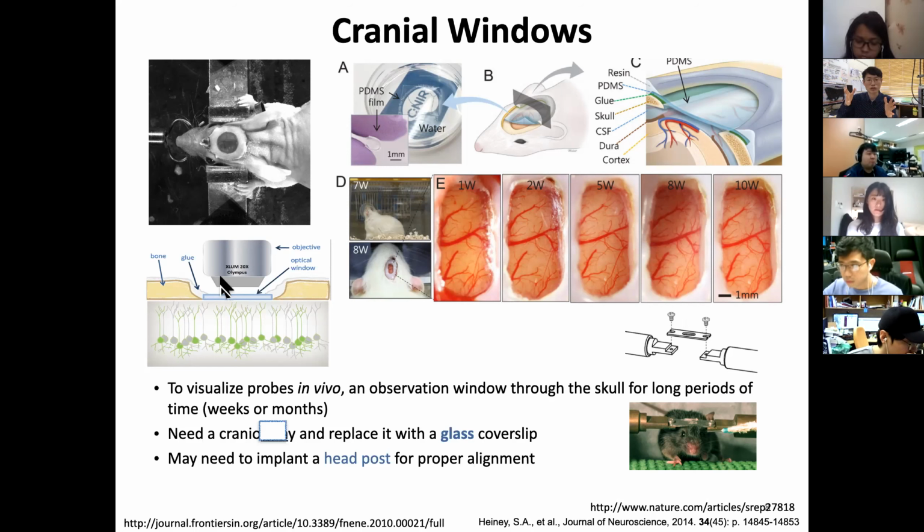Then you have to make sure your surgery is very well controlled and can last for weeks or even years. A mouse lives up to about 2 years, so a very good window can last until the mouse dies. This is a very difficult skill to develop, but I want you to experience this. Learning is one day, but perfecting can take several months to years, okay?